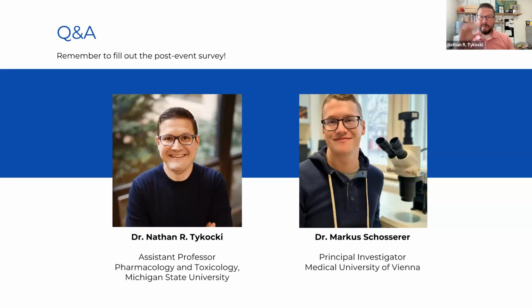Yeah, for us, everybody uses it. We don't have a choice, because if I gave choices, things end up all over the place. The only place it gets weird is with undergrads because of the constant flux of people moving. So we have a dedicated account for undergrads, because it may be one person one week and one person the next. I know SciNote might not like to hear that, but that one undergrad computer has its own account. But everyone else in the lab has their own: my lab manager, each graduate student, both technicians. Everyone is expected to put all of their stuff in it and follow it.